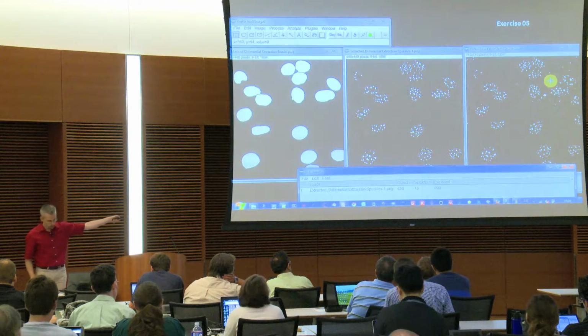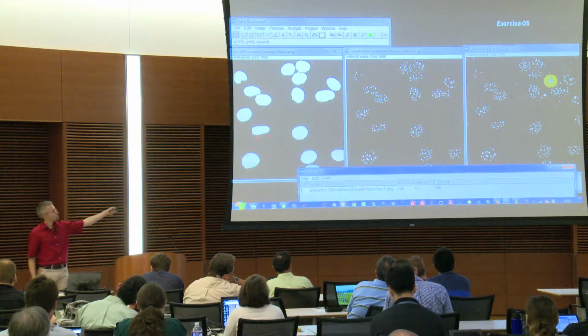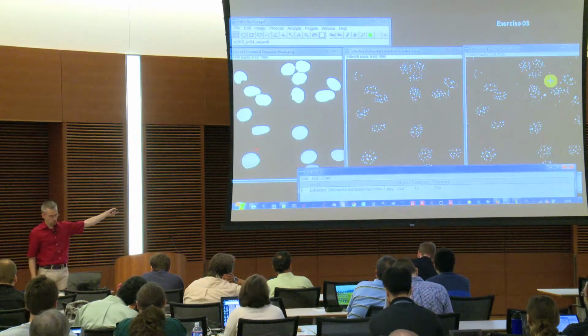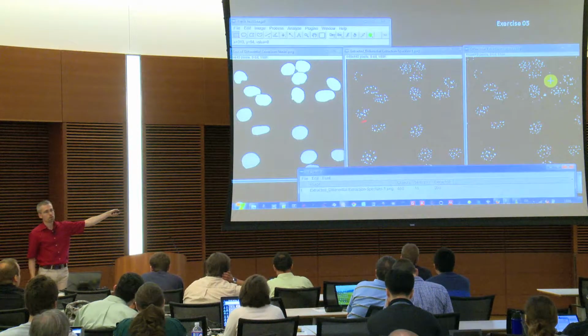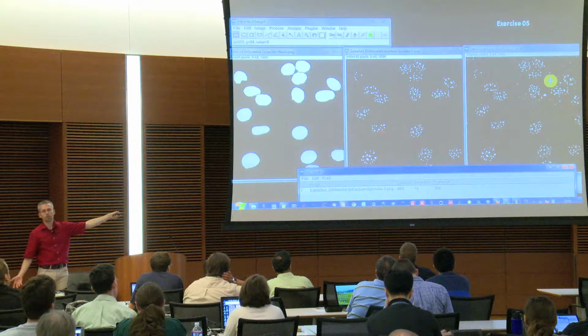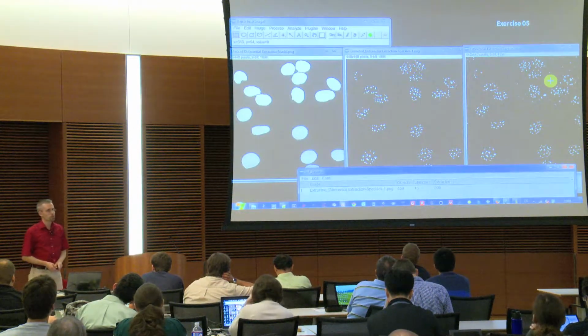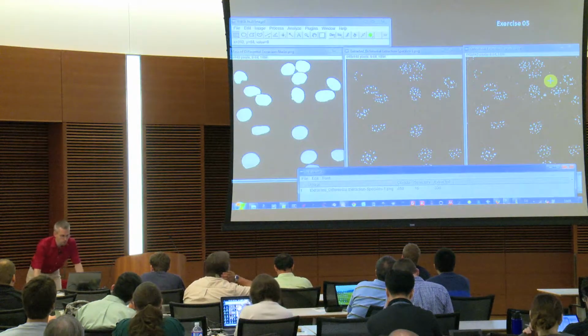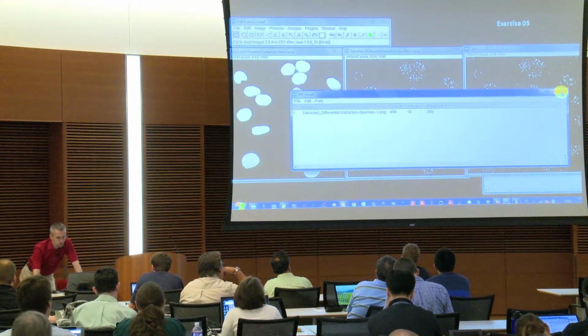These ones were exactly 458. I had 16 selectors, we have seen that already beforehand, and now I have 306 extracted. So basically I directly have my average. If I divide the 306 by 16, I have my average number of spots per nucleus. This is one option for how you could use that.